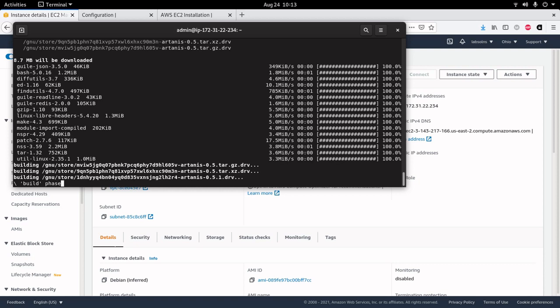Once Artanis has been built, the next phase is to install the database. Multiple scripts are run that instantiate the database, create users, tables, install the stored procedures, and install the example data. It's very convenient to run the database on the same EC2 instance as the application server. It makes for easy install and easy configuration. However, all backup, restore, and repair functions fall upon the user. In a production environment, you may want to outsource this to your IT department or to a cloud provider.